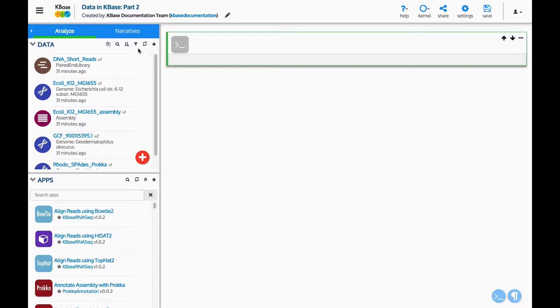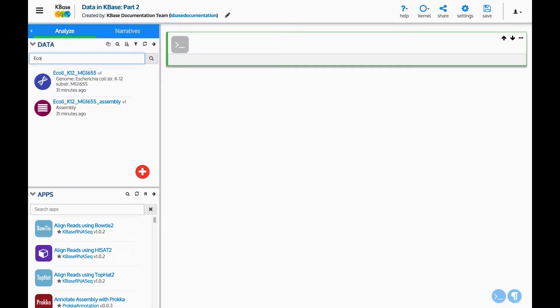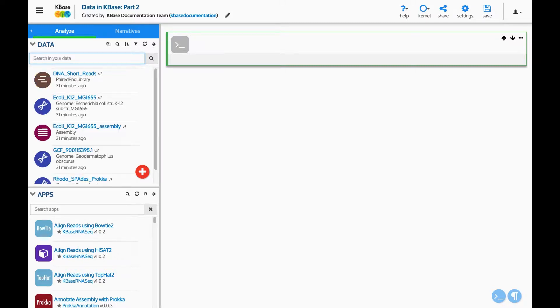On the data panel there are several buttons to help filter and manage the data in your narrative. The magnifying glass button allows you to search for data in the data panel. We can type some text to search for data that has this text in their names. The list is now filtered to the data containing the search text. When we delete the search you can see the full list reappears.